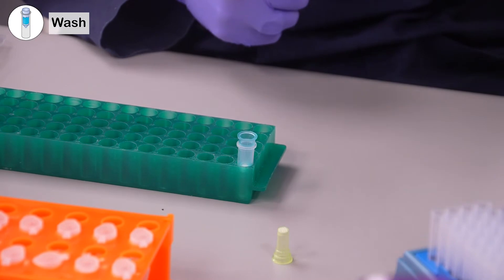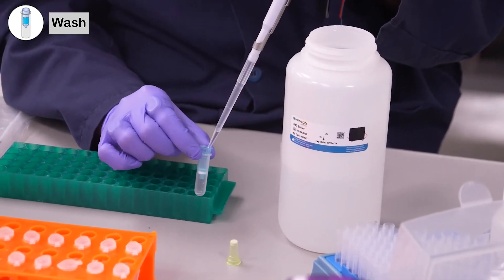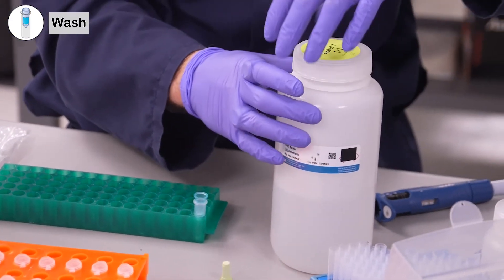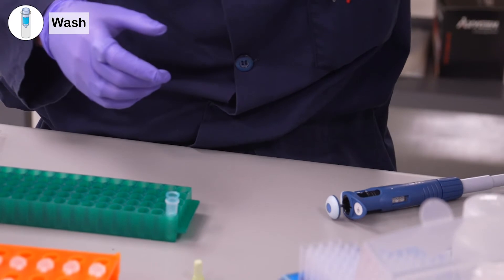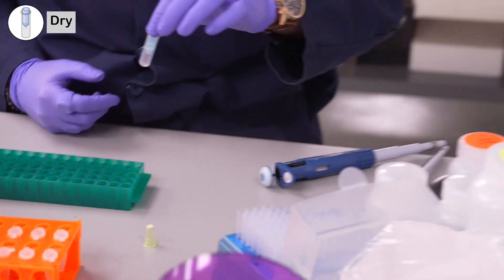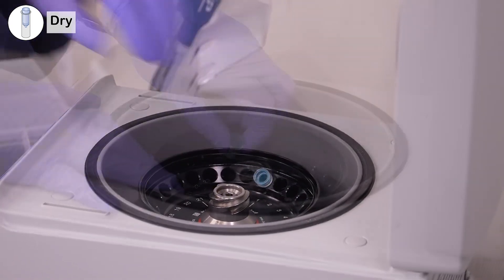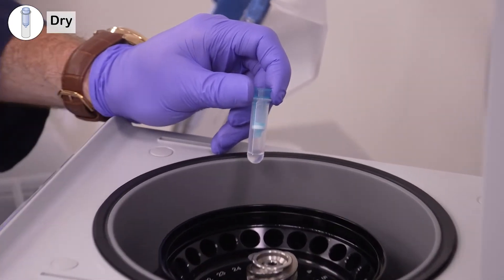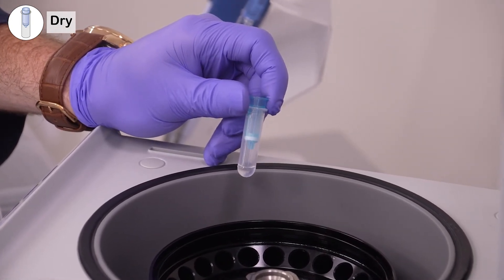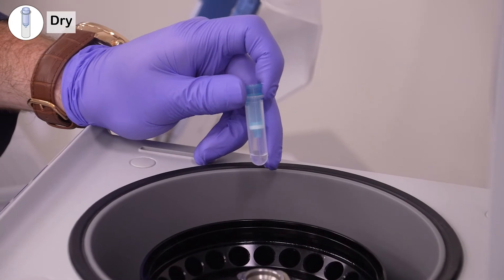Add 200 microliters of HBC buffer. Then put this back in the centrifuge for another 10 seconds. You're going to see some clear liquid at the bottom — all of the HBC buffer will have gone from the high bind tube into the collection tube.